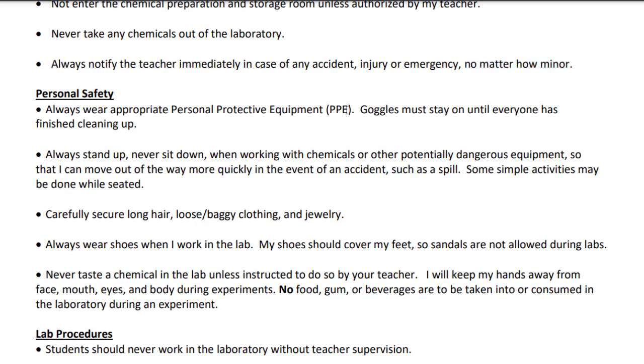Got to wear our PPE. This is a word that's very common now that everyone's been through COVID. Personal protective equipment, everybody knows this word now. This just basically means for us that if it's a type of lab where we're wearing goggles, the goggles have to stay on. Now, our first 2 labs, we don't actually have to wear any personal protective equipment because there's not really any chemicals that we're too worried about. But our last lab, where we end up blowing some things up and creating some fire, we're going to want to make sure that those goggles are on the entire time. Okay? And you'll see that when we get there.